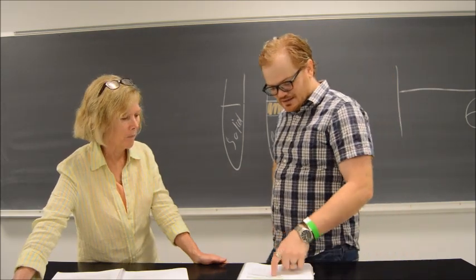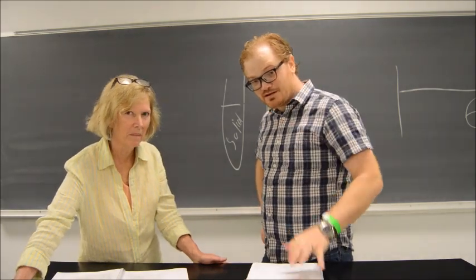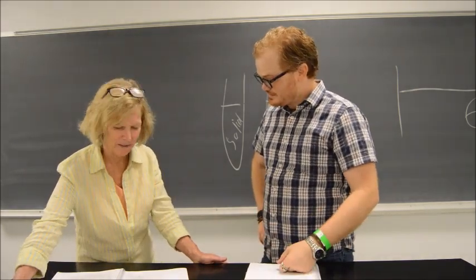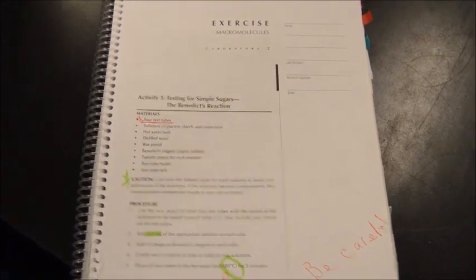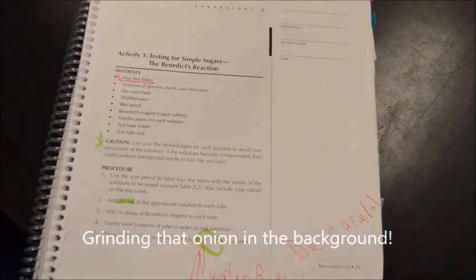And that, folks, is a nice introduction to macromolecule labs. So let's jump into the actual experiments and see how they turn out. This is your first experiment, for simple sugars. This is on page 25 of your lab manual.